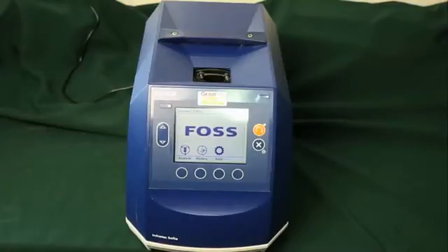It has calibrations for wheat, barley, and canola. It's very simple to use.